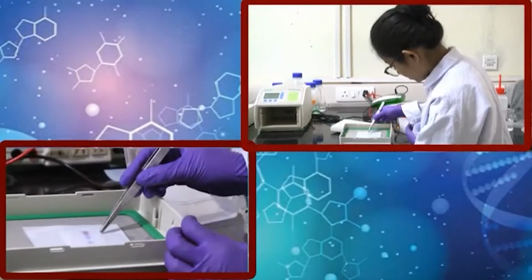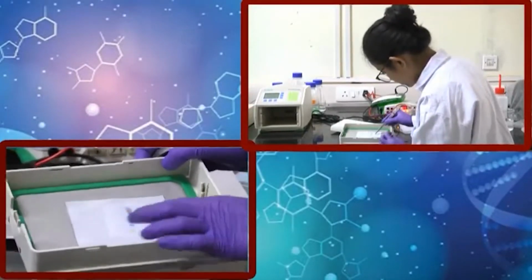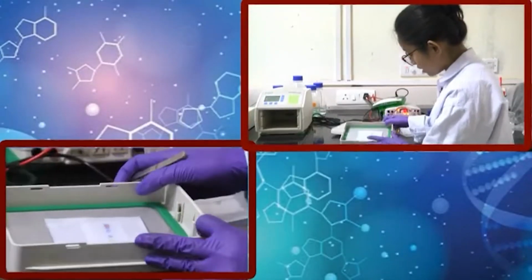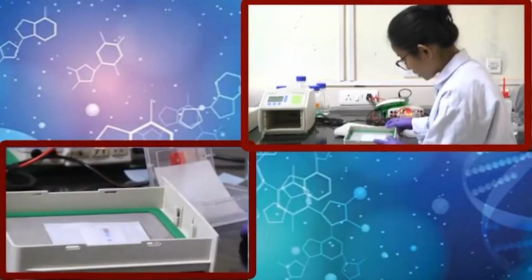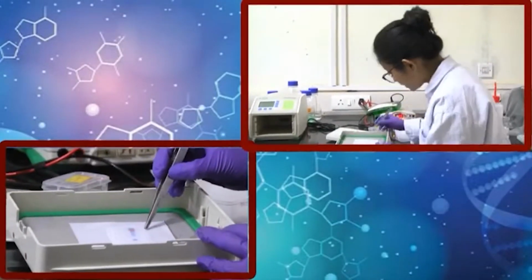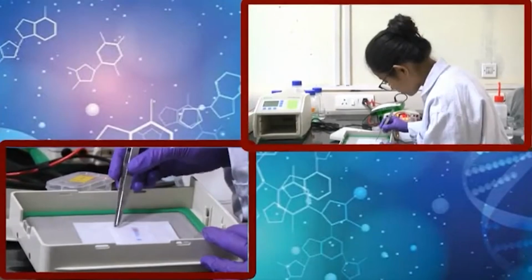As you can see, we can see all the lanes and the marker. That is why we prefer to use a pre-stained ladder in the case of a blotting gel.